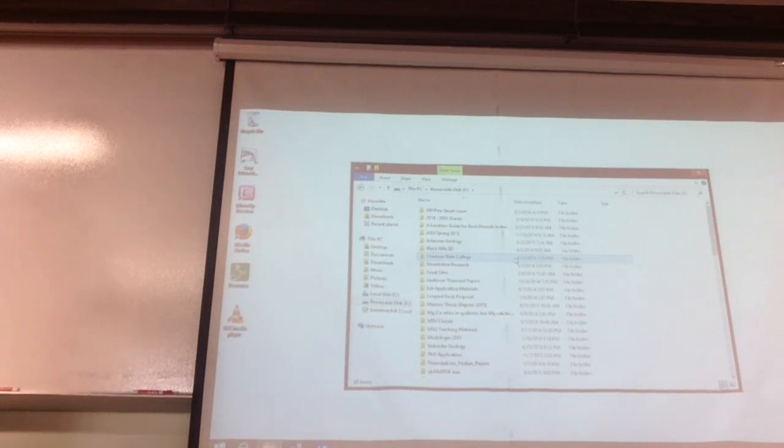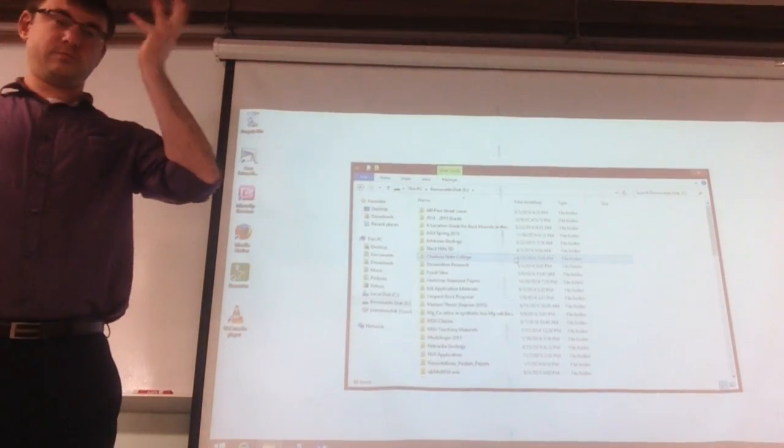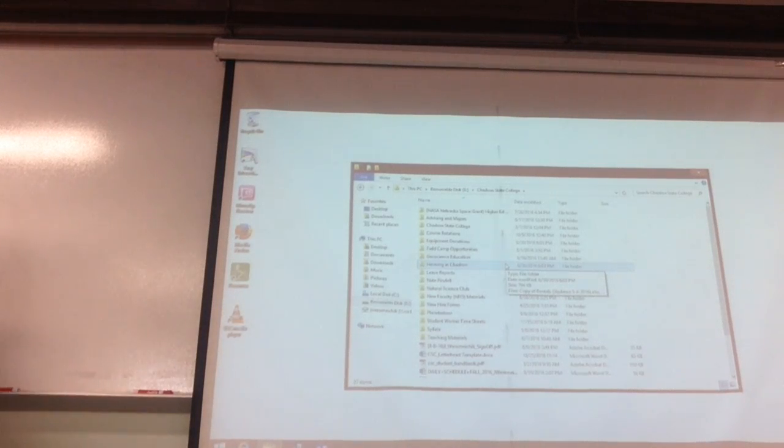I've used XRD, which stands for X-ray diffraction, or X-ray diffractometry. We just call it XRD for short because it's easier. But it's a very useful analytical technique which utilizes X-rays to determine the mineralogical composition of fine-grained material. Unfortunately, we don't have one here, which is something that I'm working on trying to remedy in the future, hopefully, so we can do fun stuff with it.